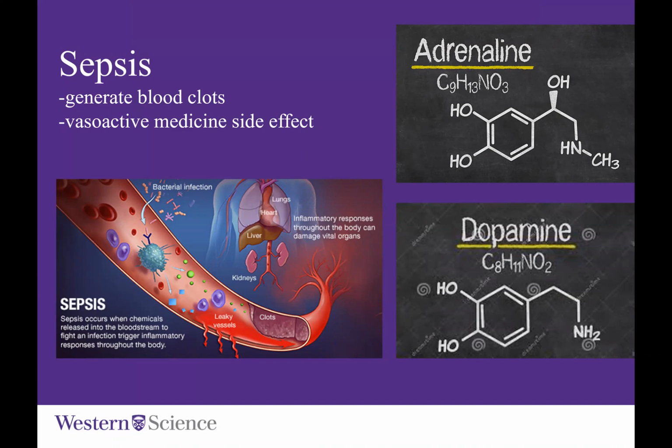Above all, both sepsis and its treatment medicine have influence on microvascular networks. For example, both of them can change the radius of vessel. Therefore, extracting data from microvascular network images is necessary for disease assessment and drug testing.